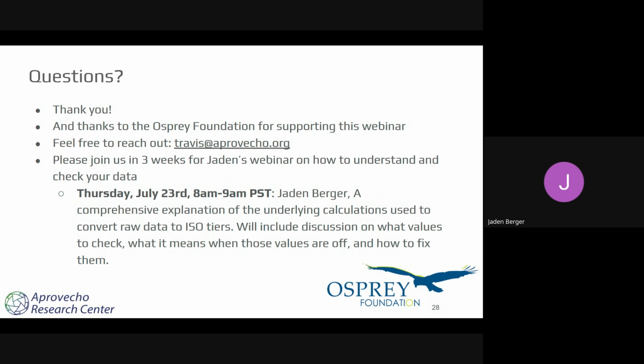A good reference point is the Clean Cooking Catalog. The Clean Cooking Alliance has a Clean Cooking Catalog. It has pretty much all of the stoves on the market that have been ISO tested. So you can find any charcoal stove that's been ISO tested, and it will have the test report for that stove. If you want a reference for a stove you're testing, you could try and find one that's similar. It's never going to be exact, but it can be a good double check that things aren't wildly out of what you're expecting.